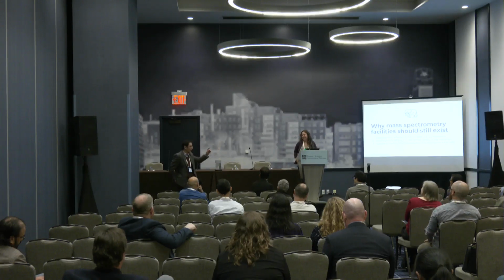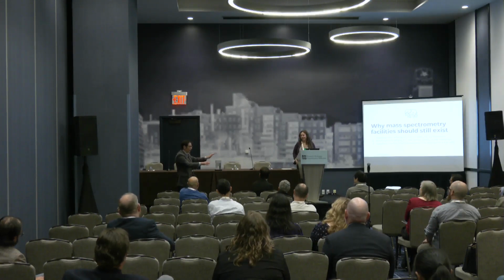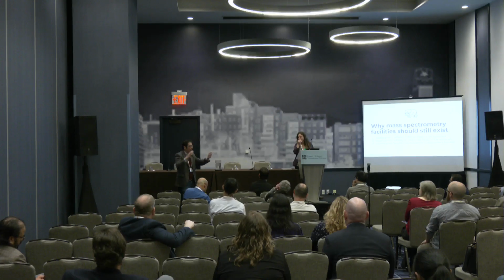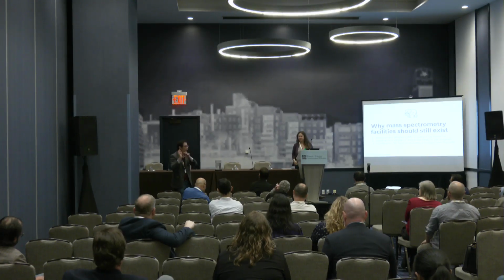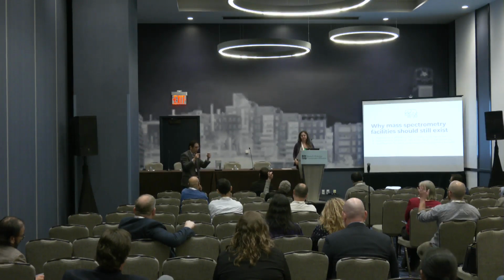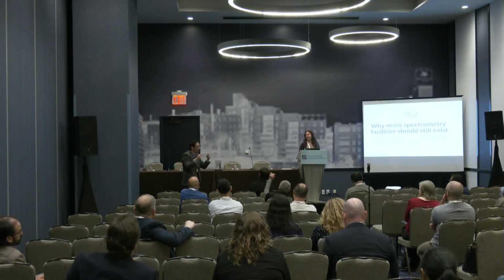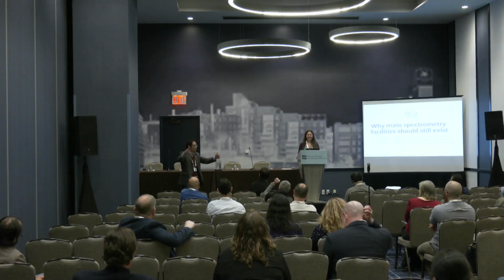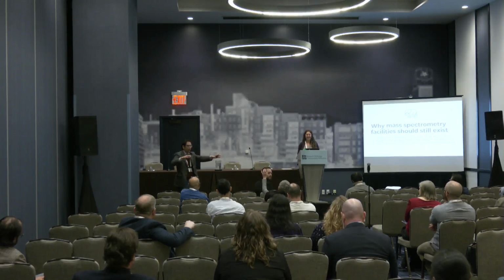Yeah, thanks for coming back to that. I agree with Lindsay. I don't think that we're going to be integrating these different types of technologies in the same experiment, but they can answer different parts of an experiment. So sometimes you might use cryo-EM to study a structure of a protein, and you might use cross-linking mass spec to study a different aspect of how things get connected. I think we'll have circumstances like that where different parts of a project will be tackled by different technologies. But the data itself doesn't need to actually be integrated in a clean way so that it presents the same measurement in both cases. Because I don't think that will ever happen.